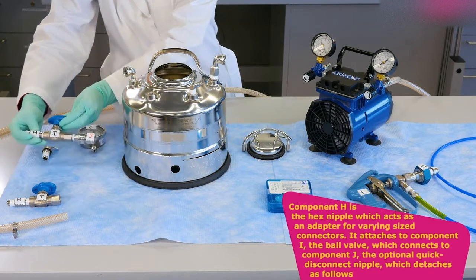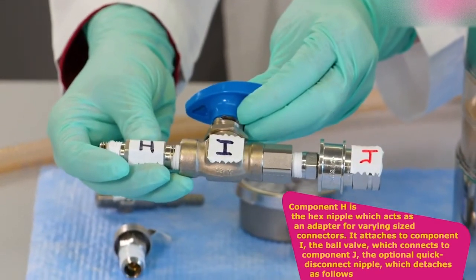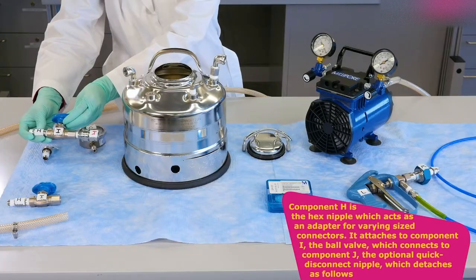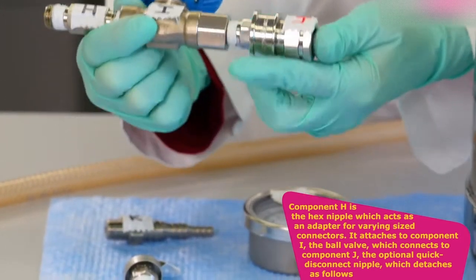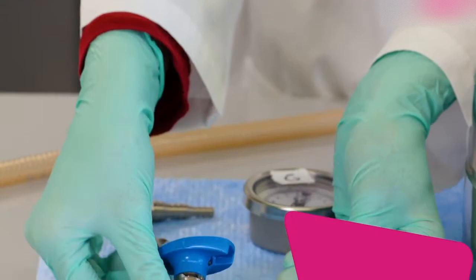Component H is the hex nipple, which acts as an adapter for varying sized connectors. It attaches to component I, the ball valve, which connects to component J, the optional quick disconnect nipple, which detaches as follows.